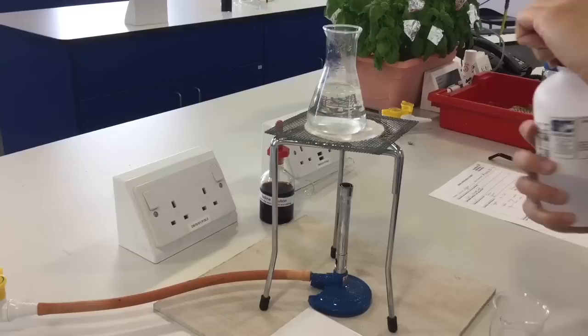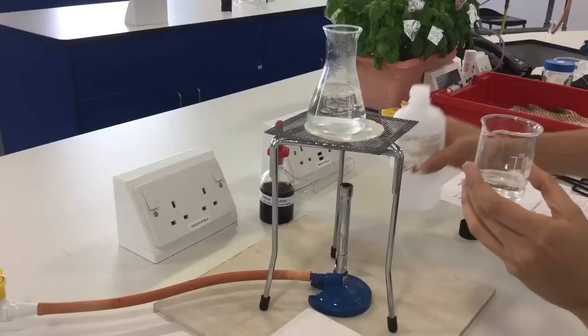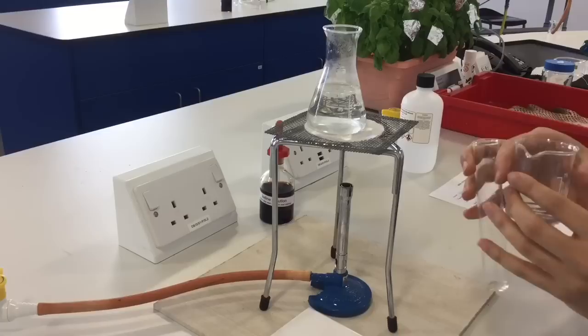The next step is to decolorize our leaf using ethanol, which is basically pure alcohol. We only need a small amount, just enough to submerge the leaf. If I measure out 25 milliliters, that should be more than enough, and that's going to go straight into our boiling tube.